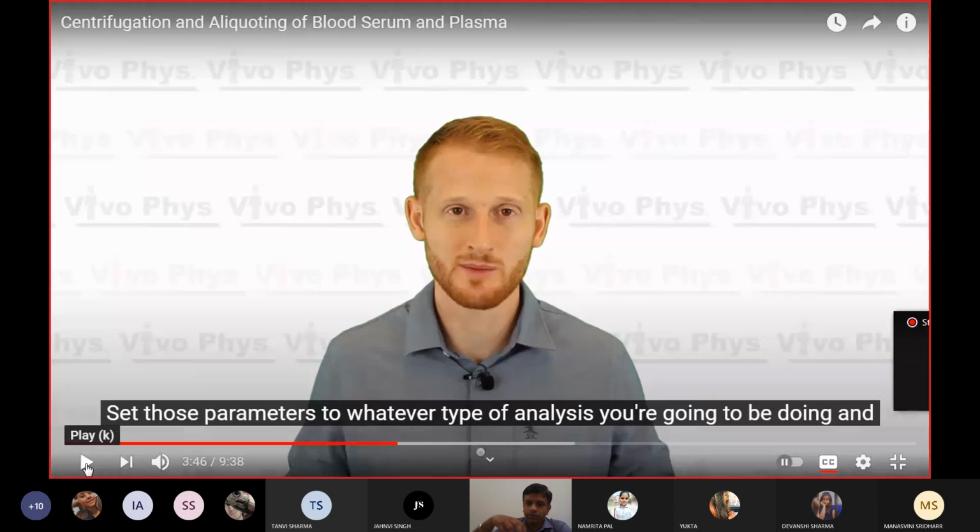Because see, the blood is in motion, right? Now, if you suddenly put brakes, this momentum gets disturbed, right? And whatever has separated after centrifugation, that may get disturbed, right? So usually we allow it to settle down by itself, so that whatever centrifugation has taken place does not get disturbed, right?